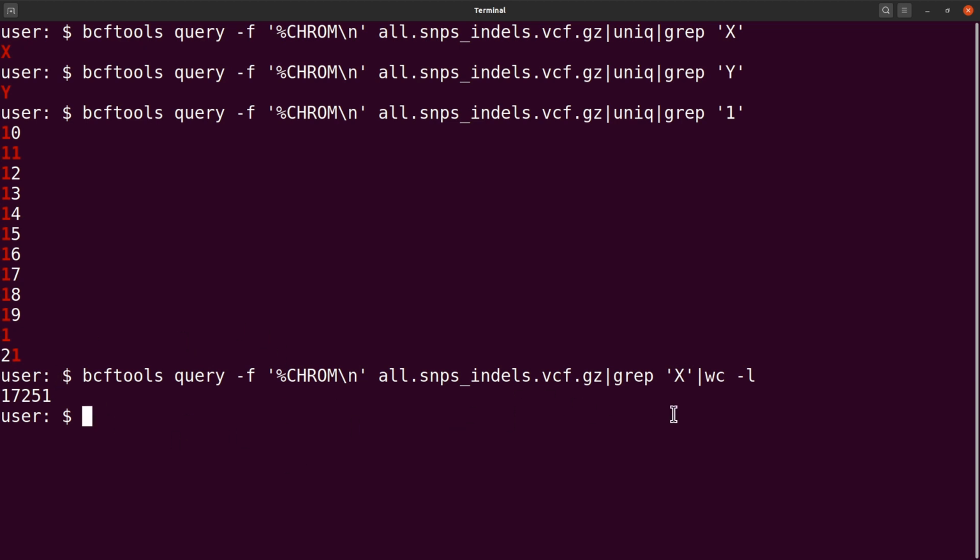Okay, so these things are there to help you to get your stuff done. But for the counting of the variants per chromosome, I have done a separate tutorial on that and I'll be uploading soon. So just monitor this channel as I will do that in the coming days. So just be patient and wait. So this is how we do it. And let me also say again that counting the number of variants using the chromosomes can be a bit tricky. So you just need to do some additional checks to make sure that you have the expected results. So just take note of that. Okay, so that's what we have.